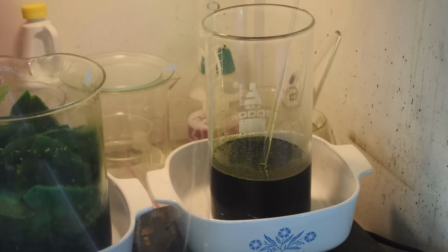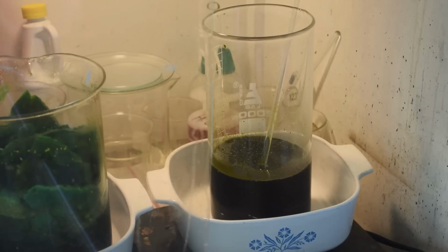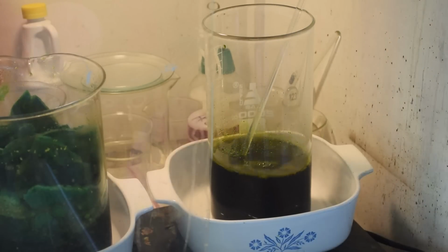Alrighty, I've got this stuff in a very tall beaker. I have warmed it slightly. I find that denoxing works better on a warmer liquid. So we're going to put a little bit of sulfamic acid in here. Well, that's kind of anticlimactic. Well, I see a little bit of bubbling. Yeah, a little bit of bubbling.